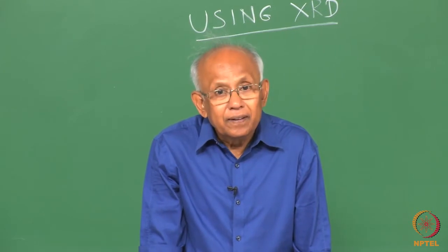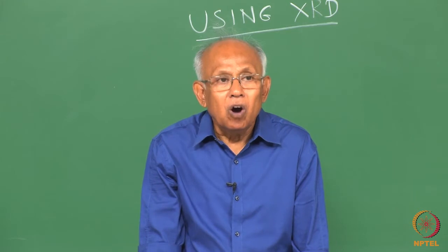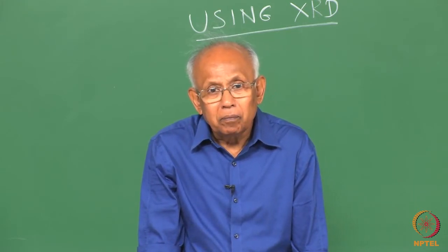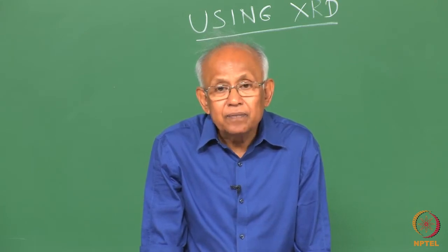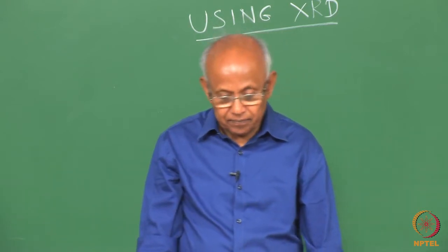Now, in this lecture I will concentrate on phase diagram determination by using X-ray diffraction, and I will consider only a two component or a binary system.